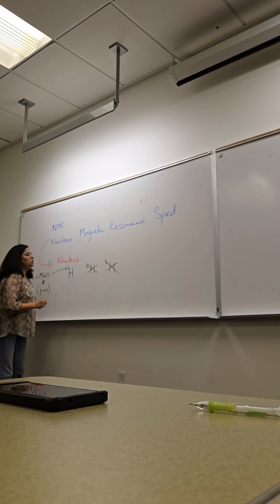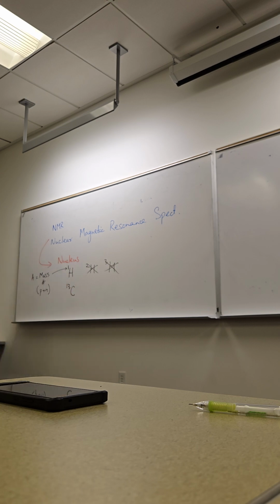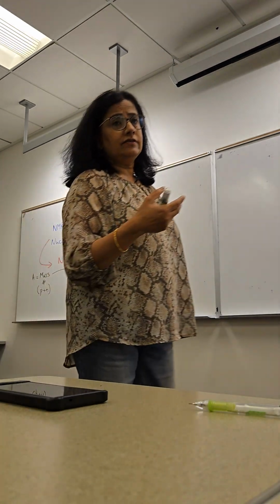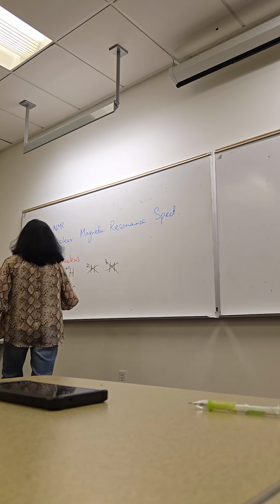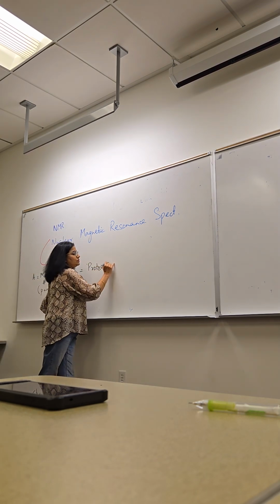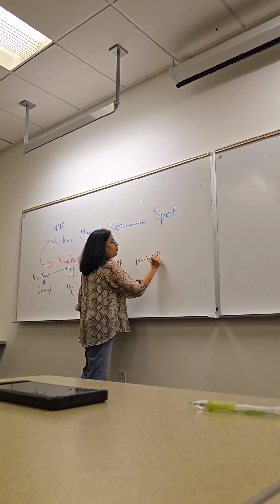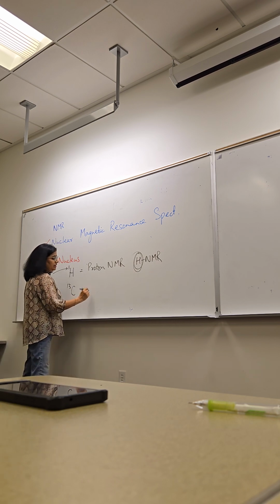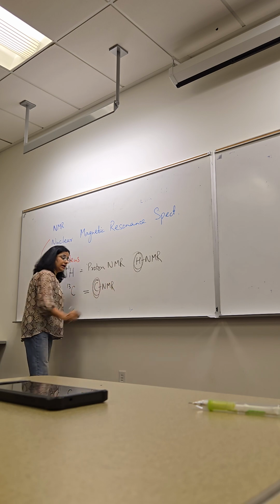And the other one that we will also look at is carbon-13. That isotope of carbon is NMR active; the other isotopes of carbon are not. So the two NMRs that we will discuss are proton NMR, also sometimes written as H-NMR because we are focusing on hydrogen, or carbon-13 NMR, C-NMR, when we are focusing on the carbon atom.